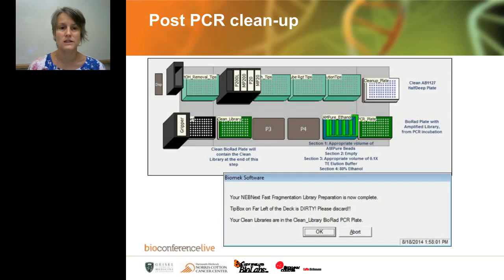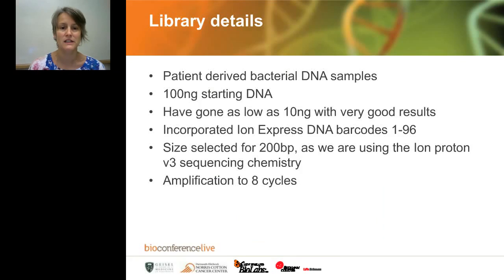So once we've done this, the QC that we do is usually Qubit and Fragment Analyzer to determine how we're going to sequence these libraries. So I'll go on and show you a little bit about one of the projects that we've done.